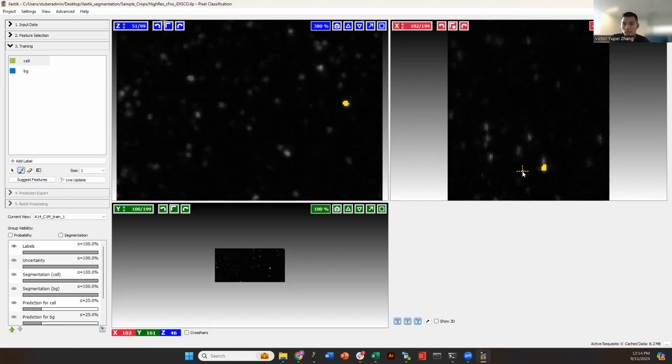Afterwards, this will generate a probability matrix, in which every pixel will have a probability, like 99% a cell or 5% a cell. Using that, the second algorithm will identify what part of these groups of probabilities is a cell or not. Then from there, they will create a mask, and ultimately identify the center of mass of that mask and give you back a coordinate of each cell.